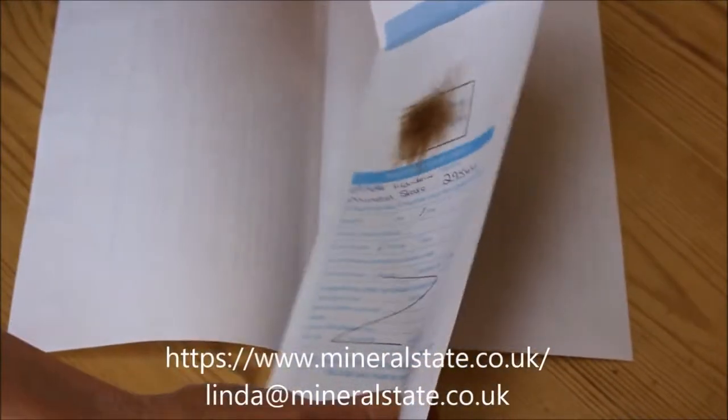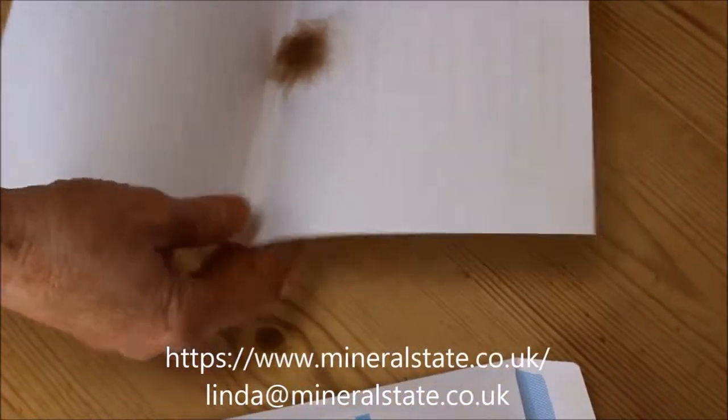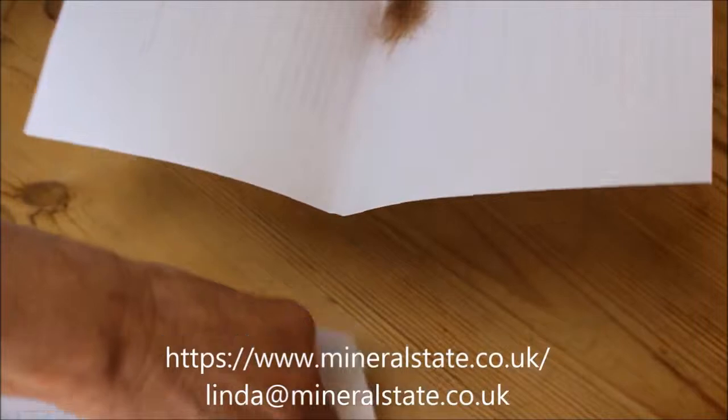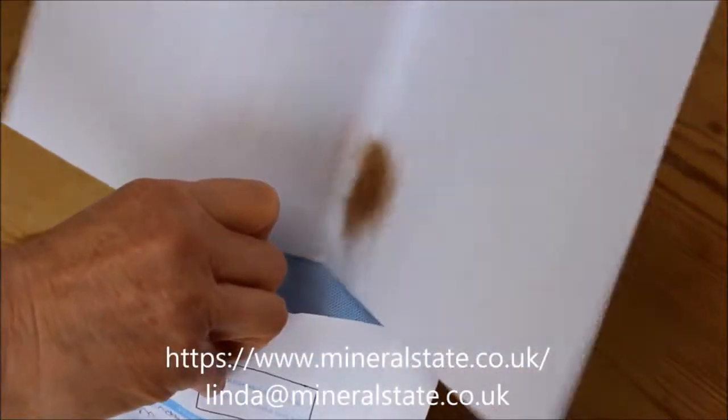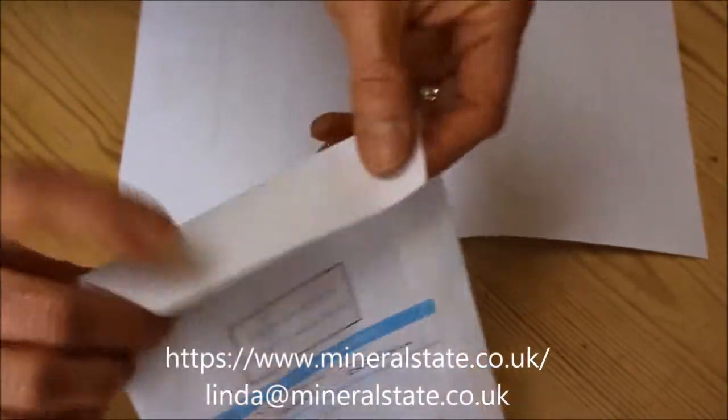The best thing to do is pour it onto the piece of paper you've had with the instructions. Open the envelope, tip the hair directly into the envelope, and then seal.